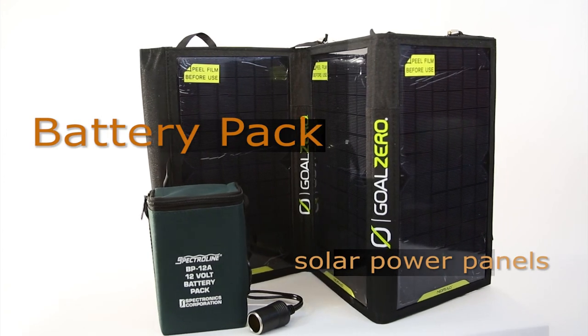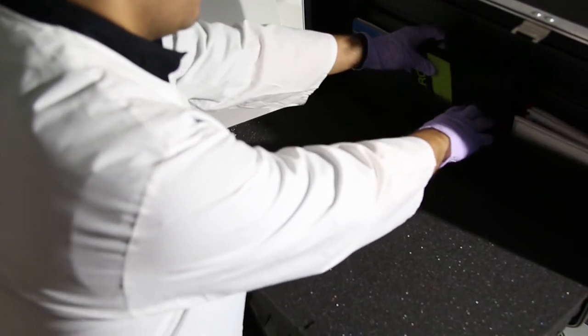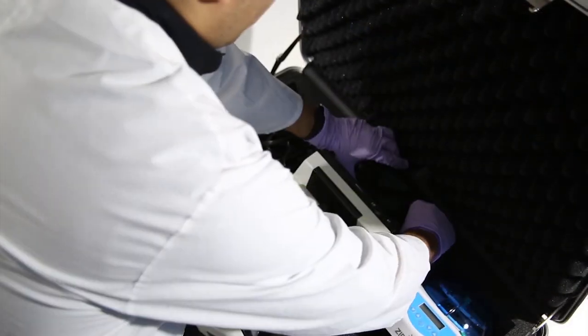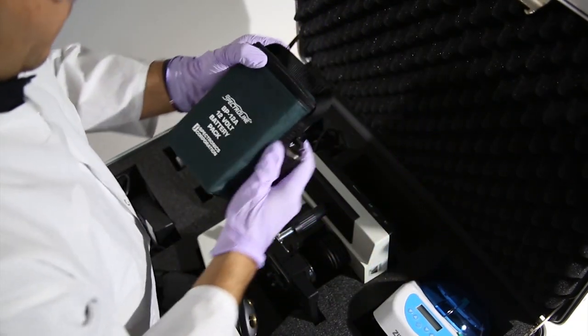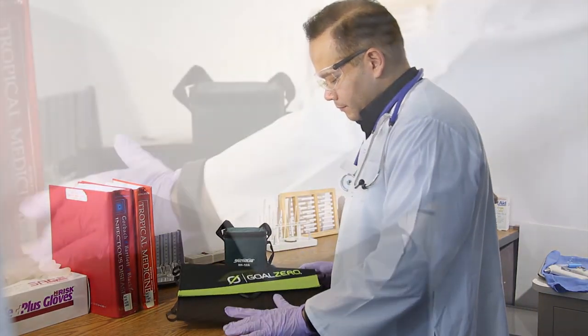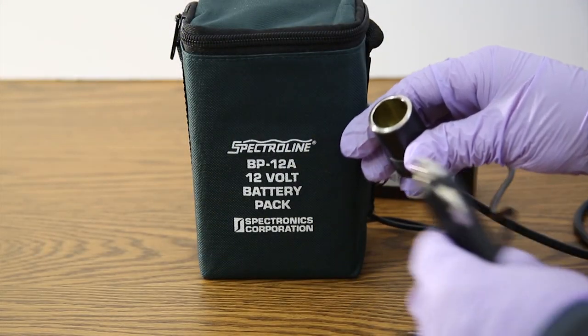Battery pack and solar power panels. The portable laboratory is designed to be independent of outside power sources and yet compatible with commercial AC power when available. A rechargeable battery is used to provide portable power for the instruments in the portable laboratory. The battery can be charged with an available AC outlet or with the included solar panel.